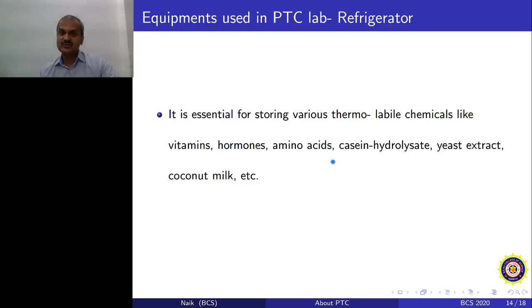Also you have to make sure that your fridge works during summertime, because the compressor takes a lot of pressure and keeps working all the time, and there is a likely chance that your refrigerator may not work. So you have to check the functionality of all these equipments and observe them.